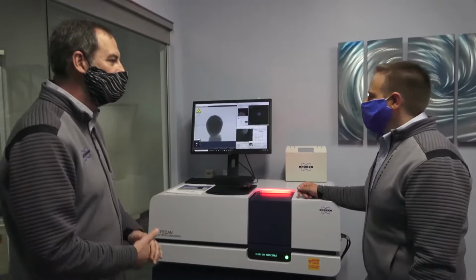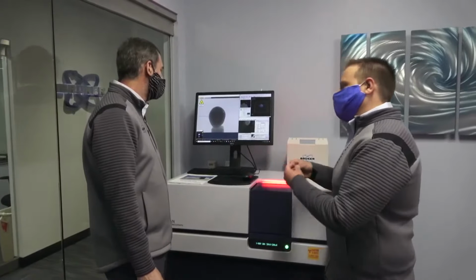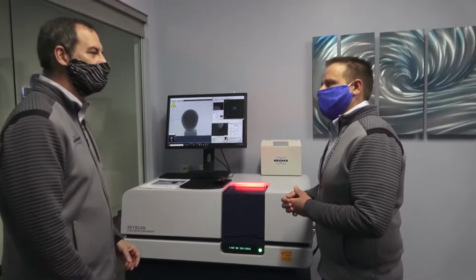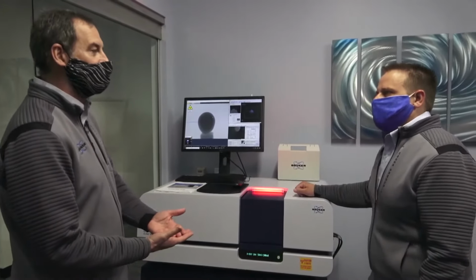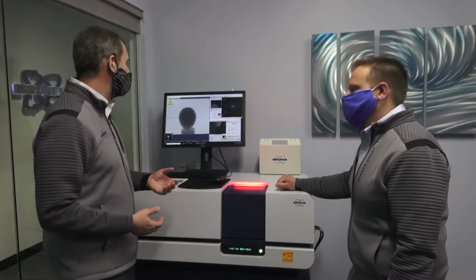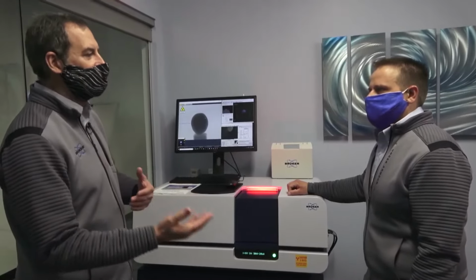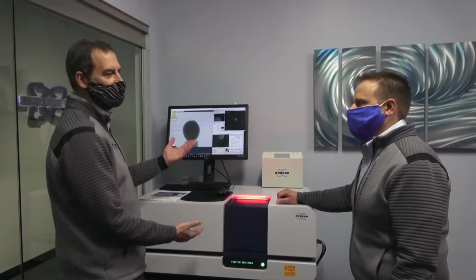Okay, and if you had a material that was maybe a little bit lighter in terms of its weight, maybe a very thin plastic, would you make any adjustments to the instrument? Yeah. So the lighter the material, the softer, the lower the energy X-rays. So this is kind of a medium material. But our system has the capability of going from 25 kilovolts all the way up to 100 kilovolts.